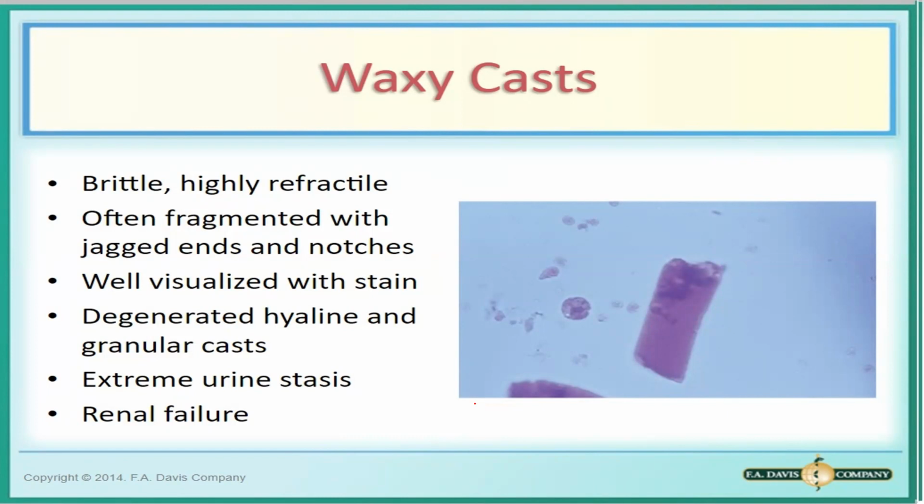Okay, question. Can waxy cast be seen without any other type of cast? The answer is no. Okay? No, that is because waxy cast, again, yung end stage ng inyong mga cast. Okay? So, hindi ka pwedeng magkaroon ng waxy cast lang na wala kang ibang other types of cast. Kasi, hindi naman agad-agad nagiging waxy yung mga cast ninyo. Matagal pa yung buhay nila. Okay, so it's impossible na lahat ng cast within the urine sample na meron ka is puro waxy lang. Okay?